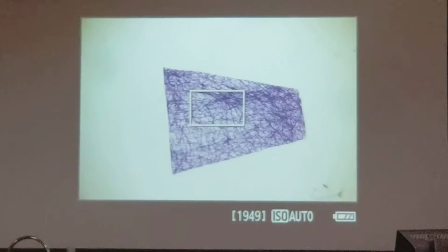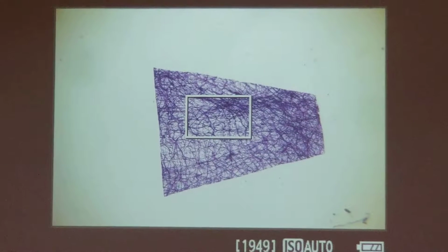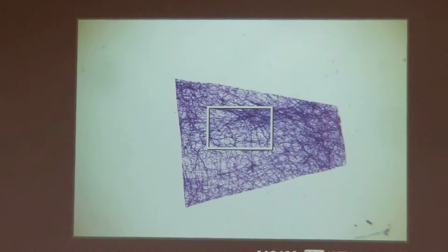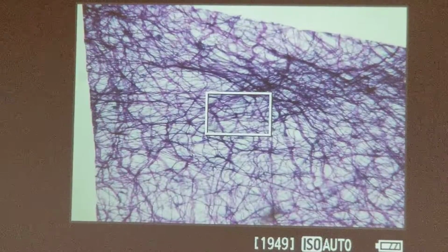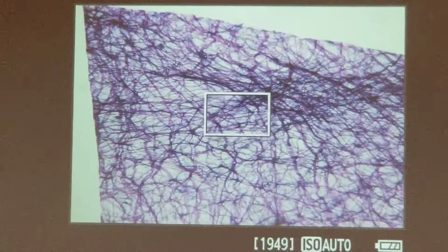Connective tissue, that's what it looks like on 4. Now, nothing really we have to add to many of these, okay? So we can't tell much at 4, obviously. Remember our routine, we do the coarse focus and we do the fine focus, okay? I'm gonna go up to 40 pretty much on every one of them, might be a couple you can get away with at 10.